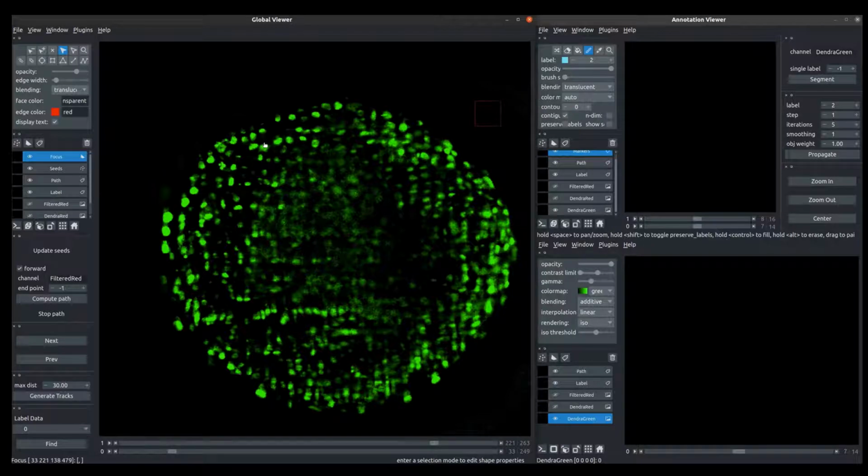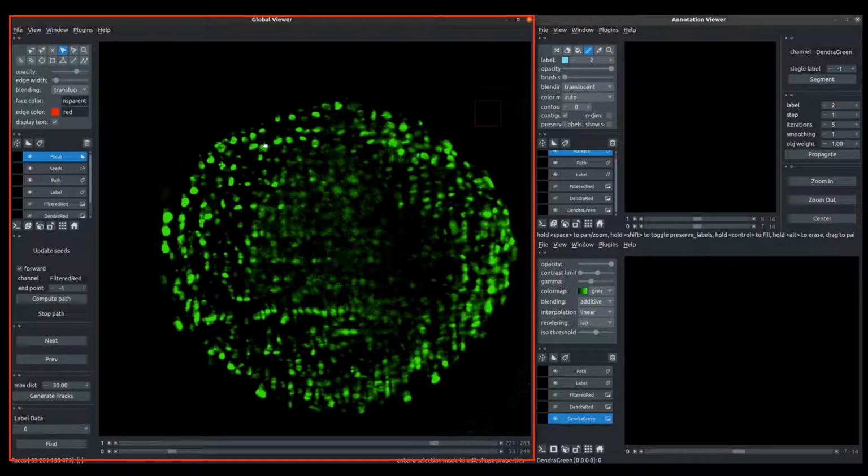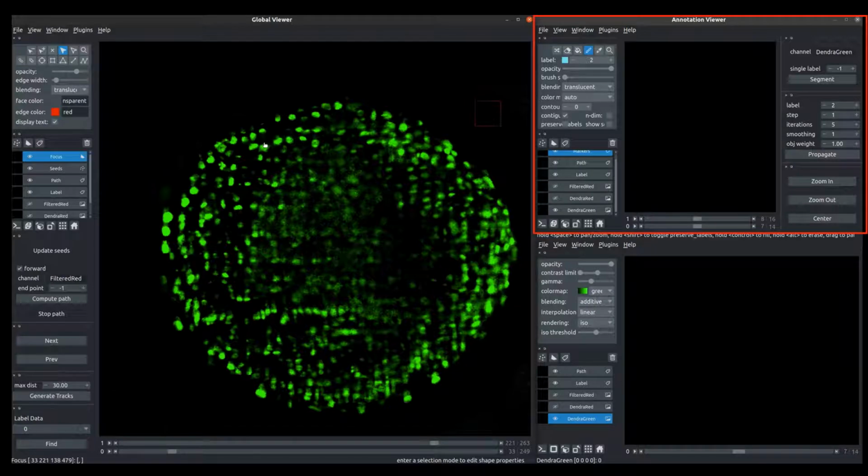To generate our ground truth data, we developed our own tool for data annotation. This tool has a main window where the user can visualize the whole data and interact with it, selecting a region to perform the annotation, which will be shown on the upper right corner, where the user can provide cues to assign labels to a subset of pixels.